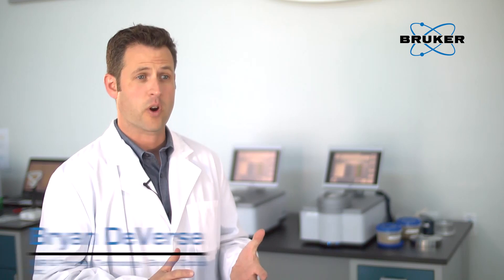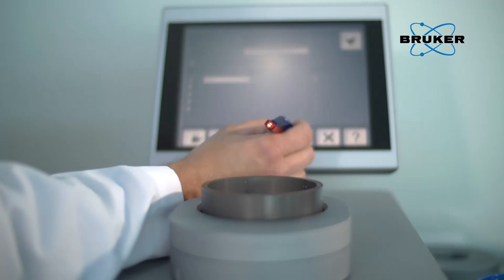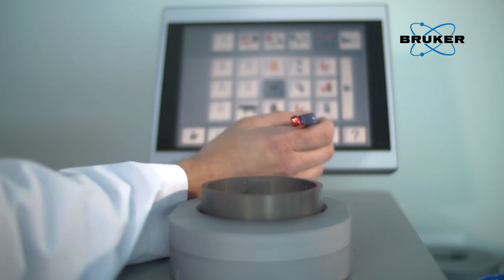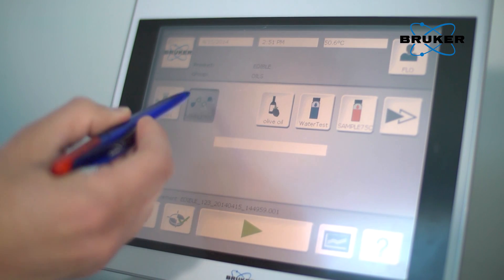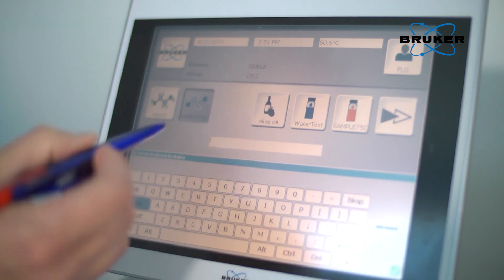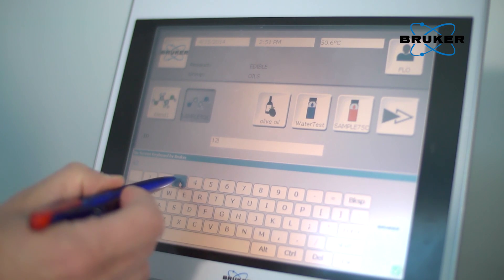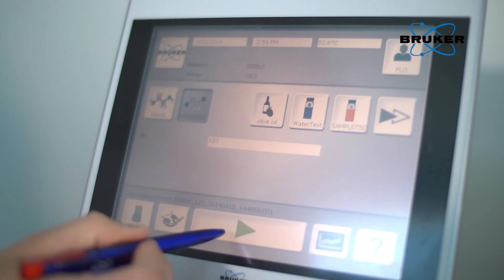The Tango software is a very powerful tool, and yet it was designed to be extremely easy-to-use software, making it ideal for quality control operations. The experience with the Tango software is similar to that one you would have with a modern tablet. Everything is icon-based, making it easy to identify the material that you want to analyze and simply touching the icon of interest and making a measurement.